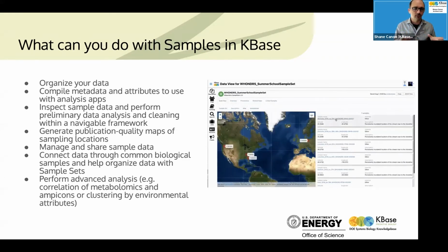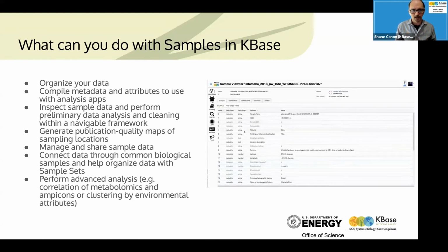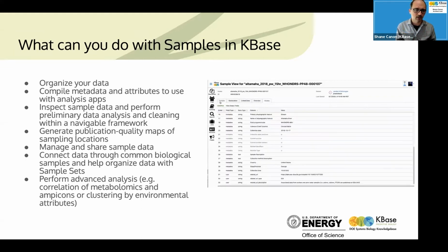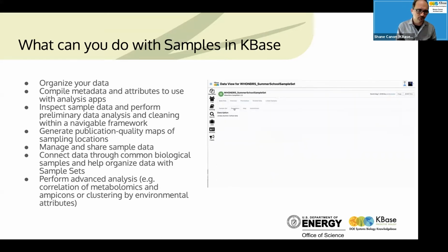So today, what it allows you to do, you can organize your data, you can compile and link metadata and attributes to these that can be used in analysis. You can use some tools to inspect and make sure the data that's been loaded is correct. We've seen this already be useful where it's spotted little mistakes even in some of the test data we've used.